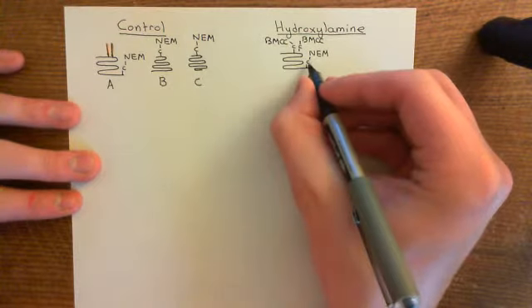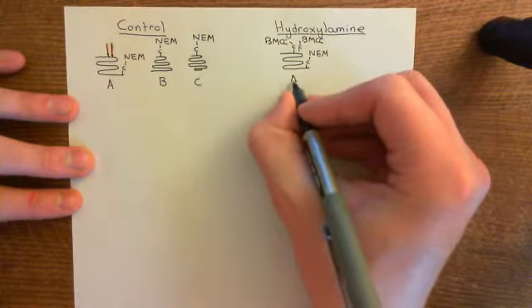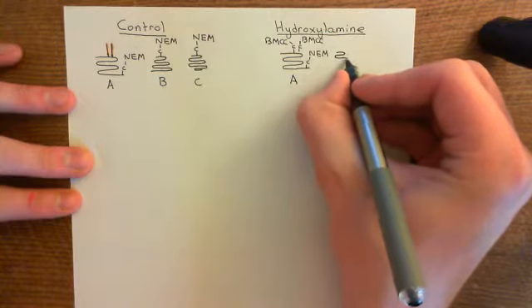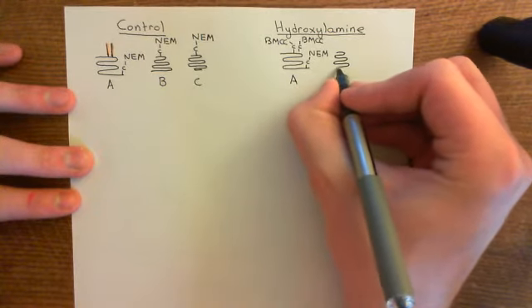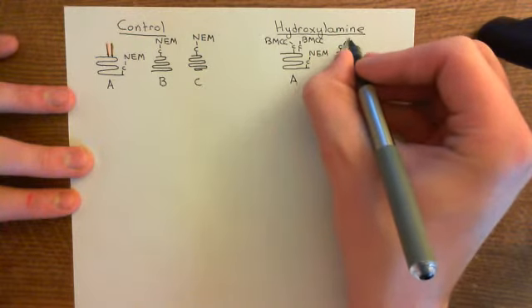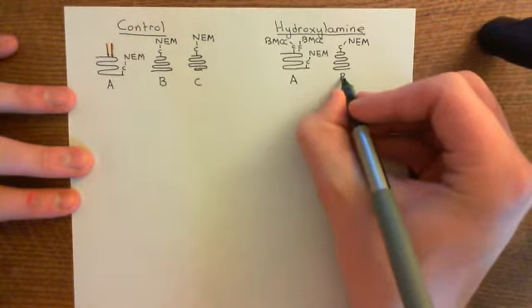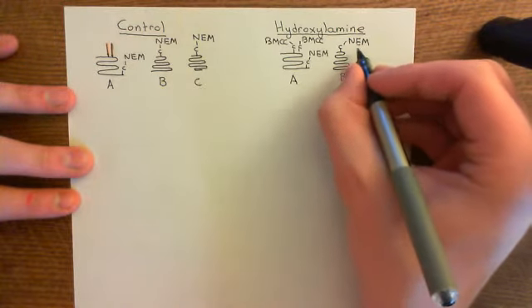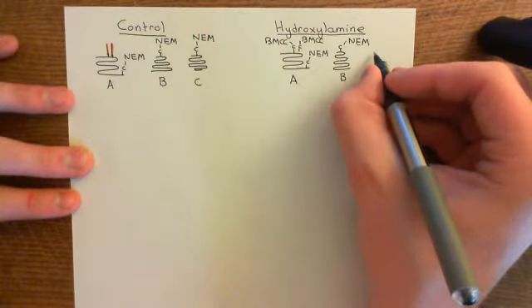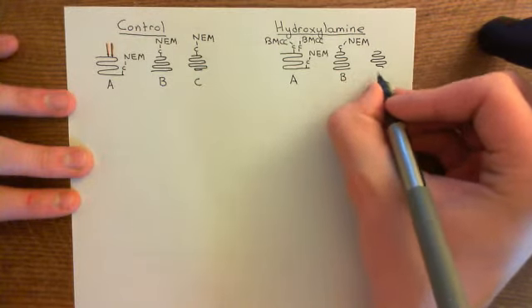And of course the cysteine that originally was free and therefore got N-ethylmaleimide bound to it will still have N-ethylmaleimide bound to it. Now for both protein B and protein C, you had no palmitoyl groups originally bound to cysteines. So all of the cysteines were originally free and therefore all had N-ethylmaleimide added onto them, and therefore were all involved in bonds already and couldn't have BMCC added onto them. And this is the same for protein C over here.